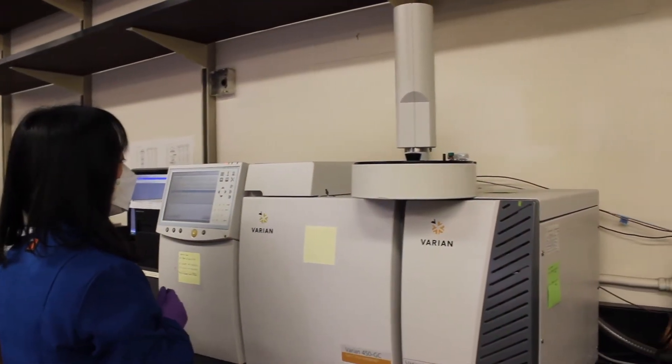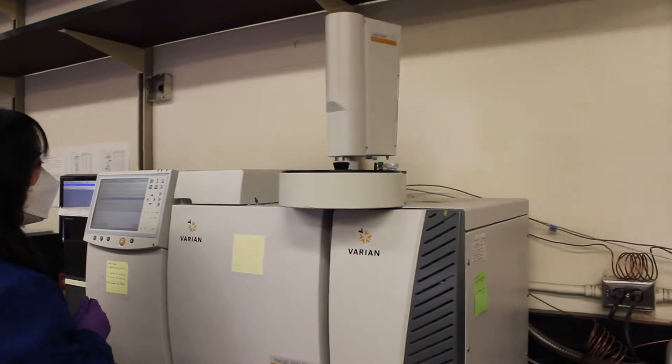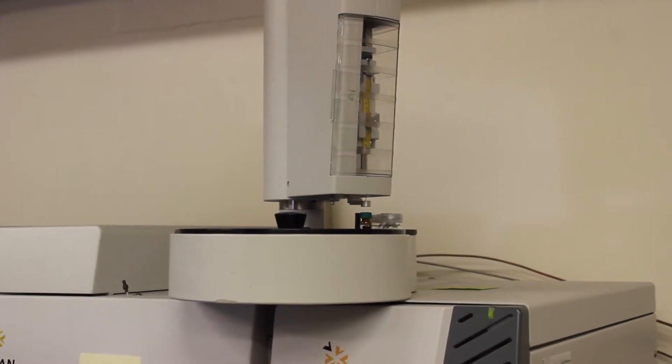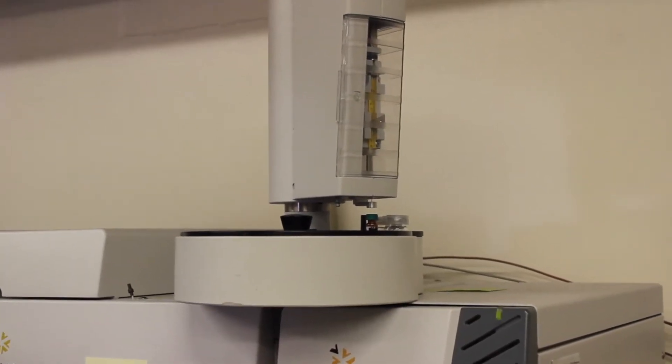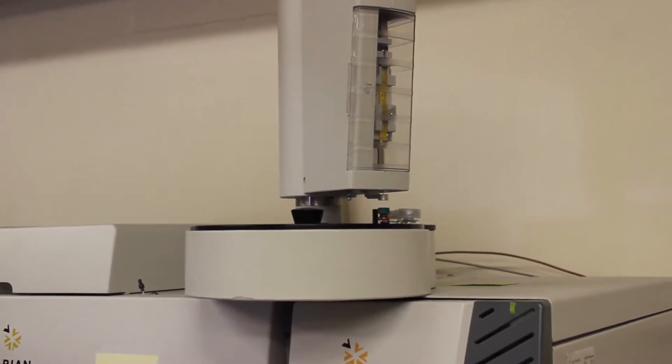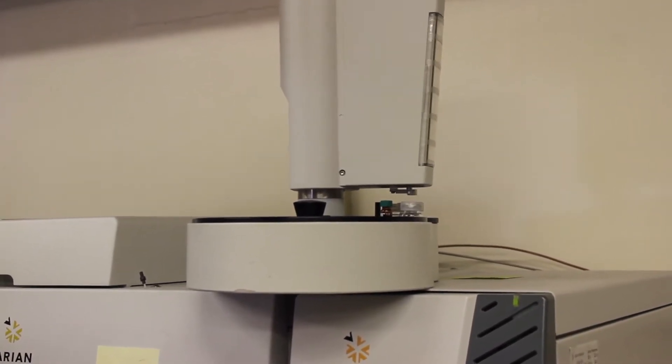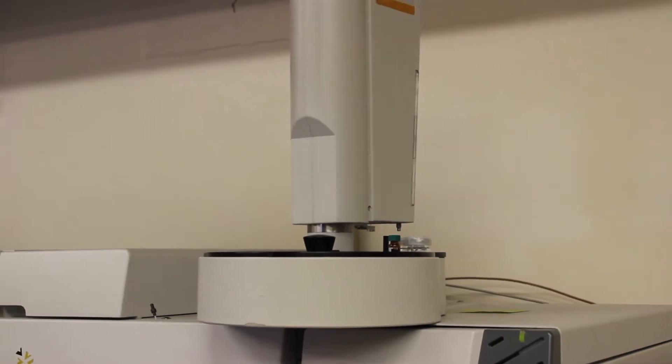This is the oldest instrument in our lab. It's a gas chromatography with a flame ionization detector and an ion-trap mass spectrometry detector. We've been using this for purity analyses of edible oils such as fatty acids and sterols since 2010.